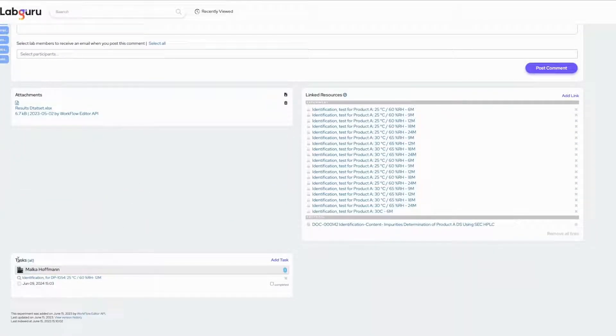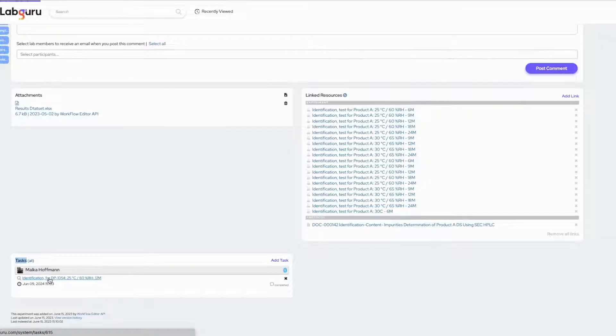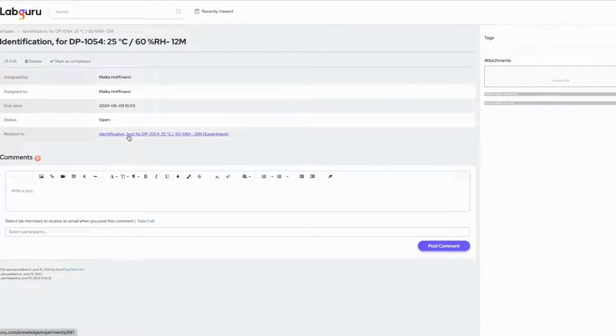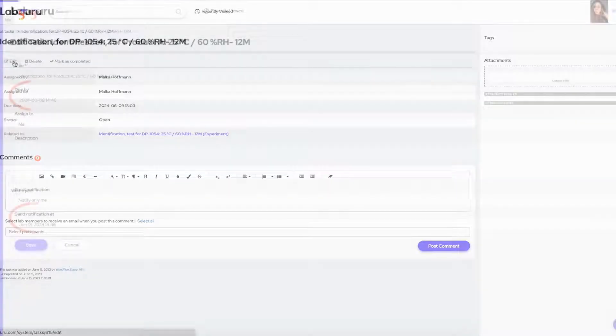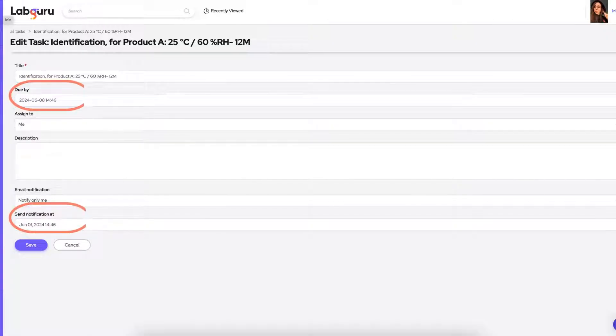Another outcome of this automation is the creation of tasks for each stability time point. These tasks are automatically placed in your LabGuru calendar according to each stability time point. Each task is linked to its related test and has a notification set to be sent one week before the due date.